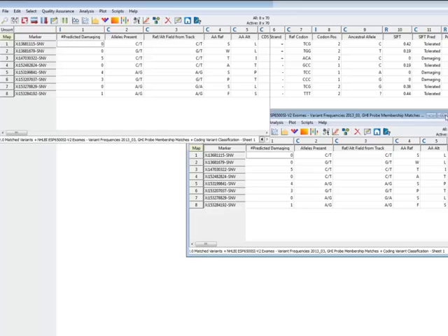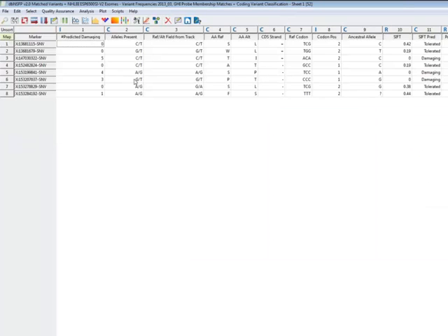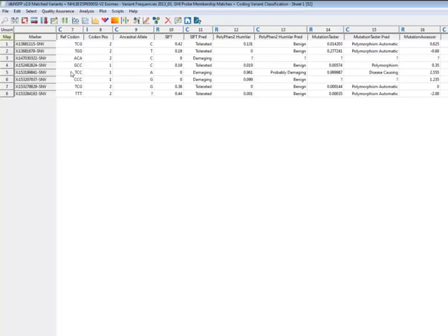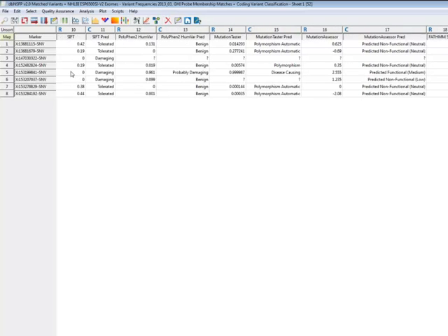And now I have a giant spreadsheet with 80 columns or 70 columns, something like that, but I can pick out this variant. I can see that 4 of my 5 algorithms predicted it to be damaging. See what the amino acid change is. Scroll across, see. So SIFT calls it damaging, PolyPhen-2 probably damaging, MutationTaster says disease-causing, MutationAssessor calls it functional, which is their version of damaging. FATHMM says it's tolerated, but FATHMM's always kind of an oddball. We'll talk more about functional predictions later on.